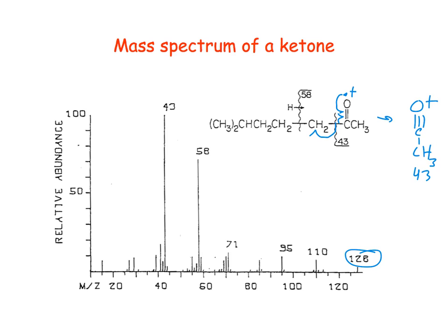I'm losing that big thing. So what about this 58? That's just the McLafferty rearrangement, right?